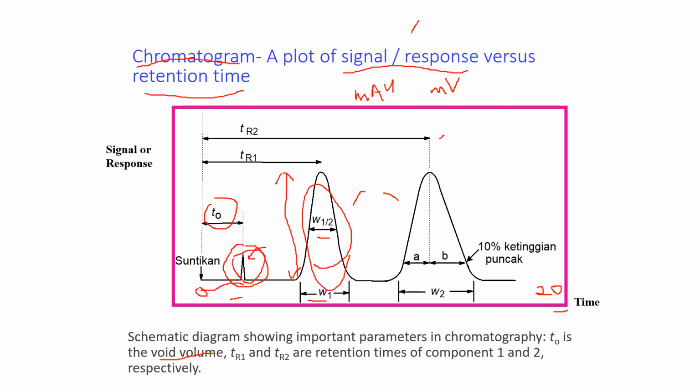Usually we use the peak width over here when your peak is slim, tall, and pointy. But if you have a very broad peak, sometimes this can help you to calculate the efficiency. Do you still remember what the efficiency label is? It's N. Okay, next slide.